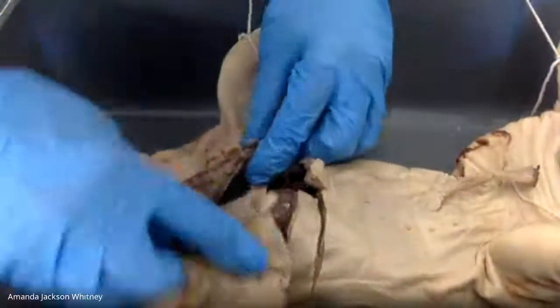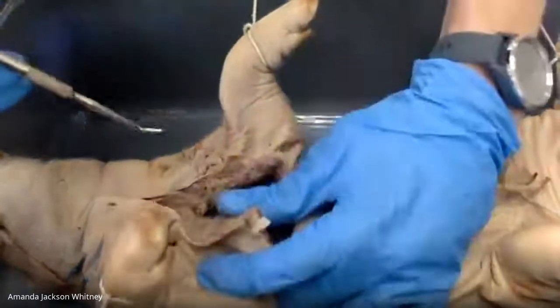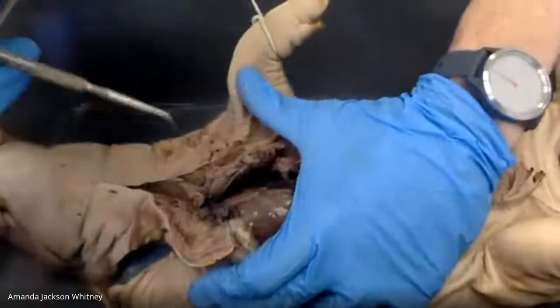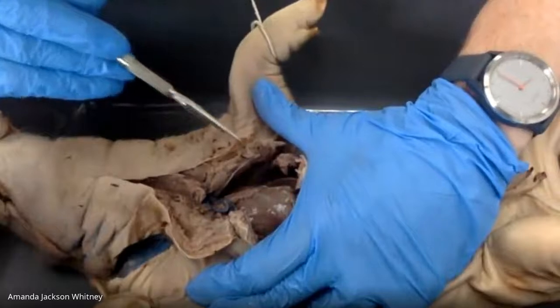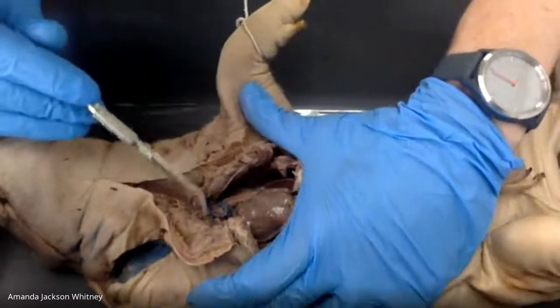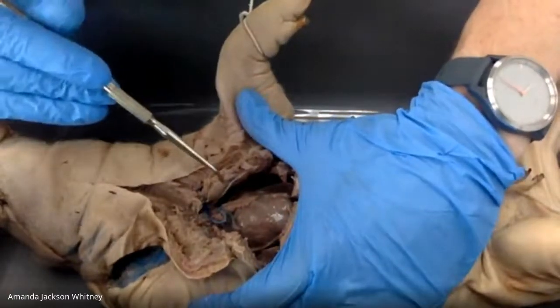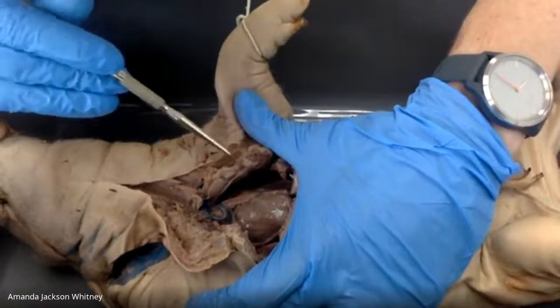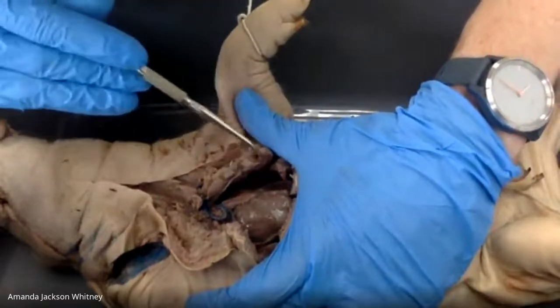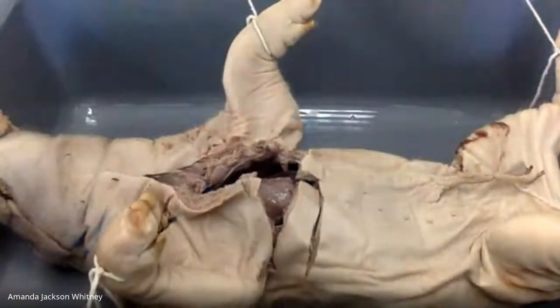So you might be able to see here, these are the ribs. Okay, so these right here are the ribs, and then in between the ribs, you can see that intercostal muscle. It's kind of hard to see which direction they're running right now, but that would help to tell us which are the internal intercostals and which are the external intercostals.